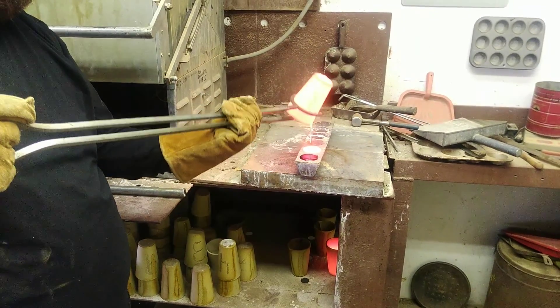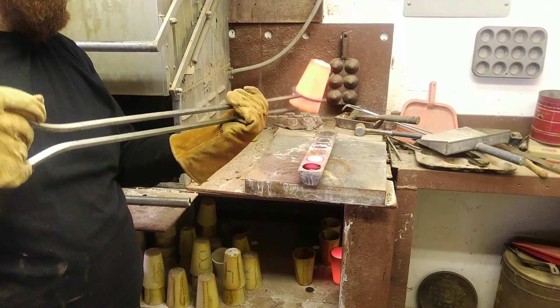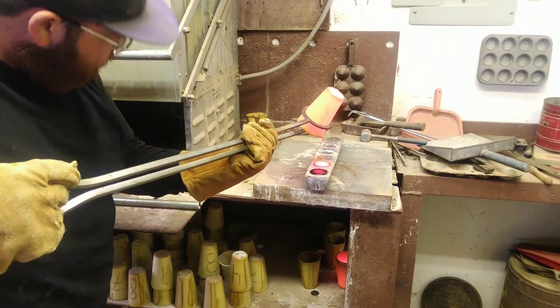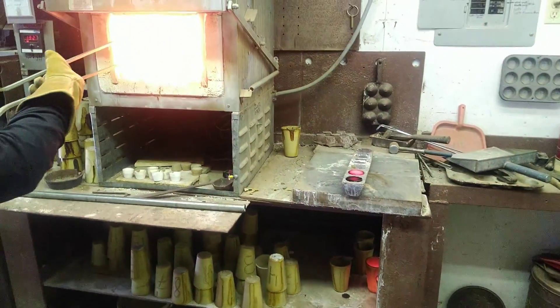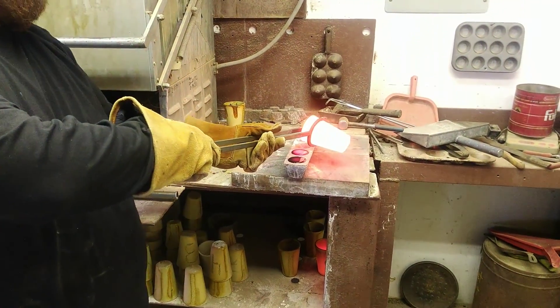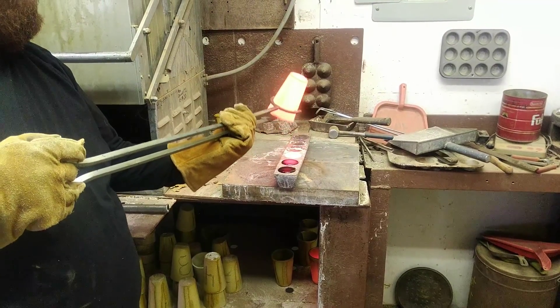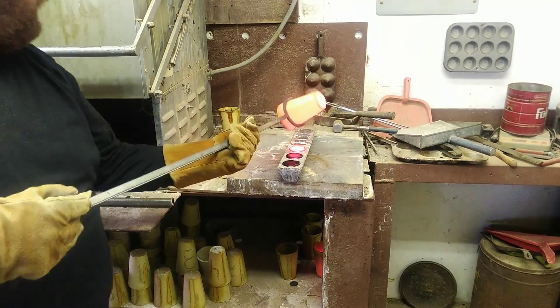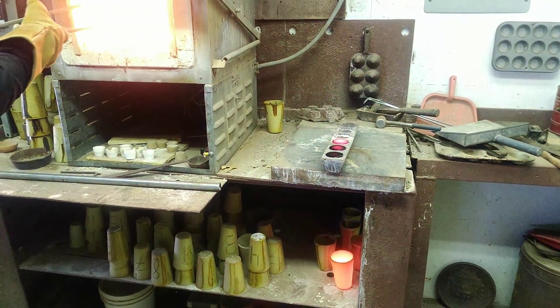We've been concerned about it from that mine. There's a little bit in that one — see how it's a lot thinner? For our viewers, fluorospar means the ore is essentially unsuitable for use as smelter flux and has to be run through a mill. We can't just sell it to Freeport or Sarko and make money that way. There have been a lot of mines around here that make a lot of money selling flux, so here's hoping for high silica, but we'll have to have a whole-rock analysis done on it.